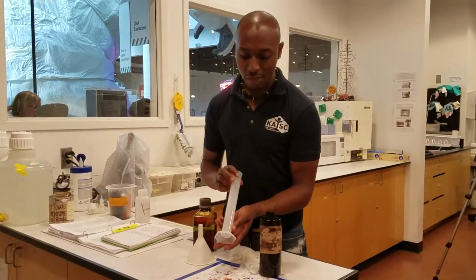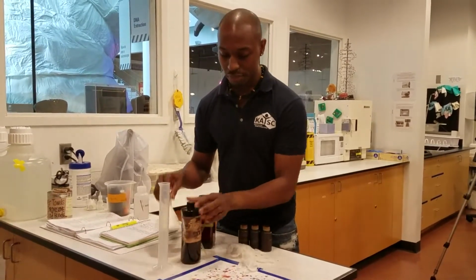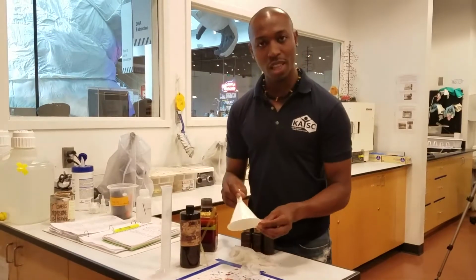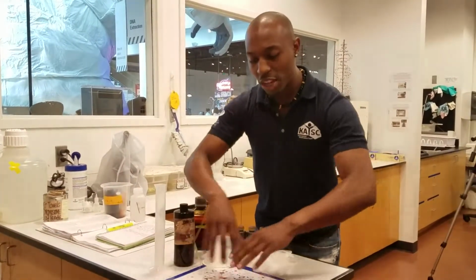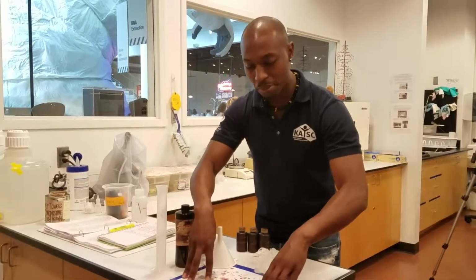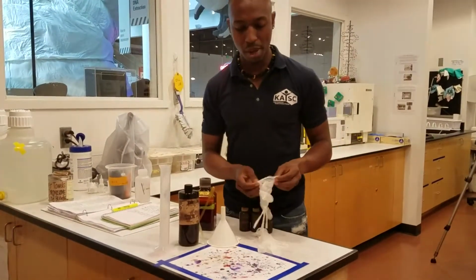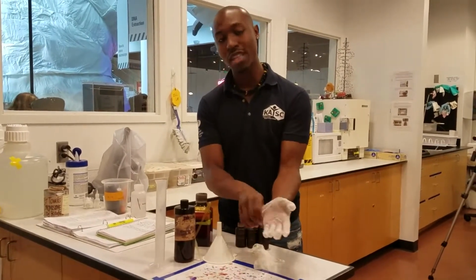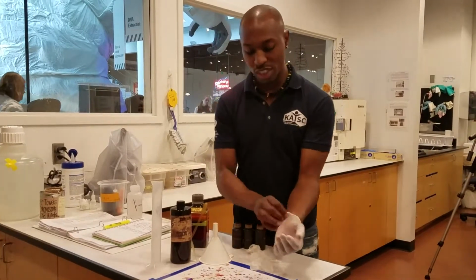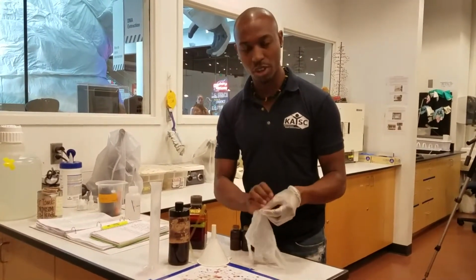My materials I have here is the cylinder, the 100% Lugols iodine, as well as the funnel, as well as I got my gloves. Why am I in this area is because this is where we're supposed to be when we're working with stains. As you guys can see, this filter paper is messed up with some stains. Always have your gloves when you're working with the type of experiment that has to do with stains or chemicals or powder or anything like that, okay?